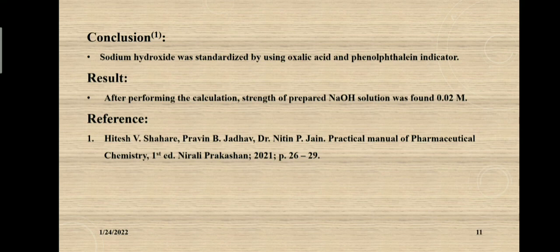We can conclude from the above experiment that sodium hydroxide can be effectively standardized using oxalic acid, and the addition of phenolphthalein indicator helps make the acid-base titration easy by detecting the end point. From the calculation, the strength of the sodium hydroxide solution was found to be 0.02 M.